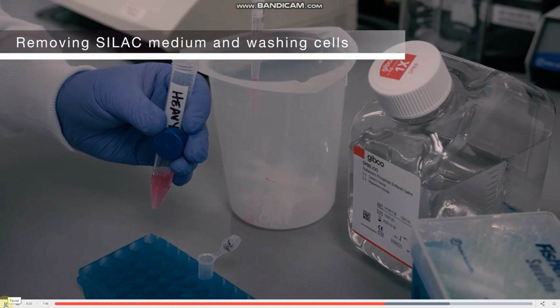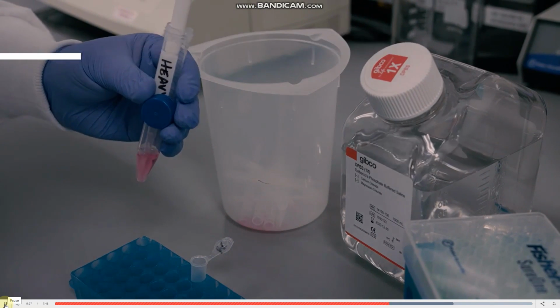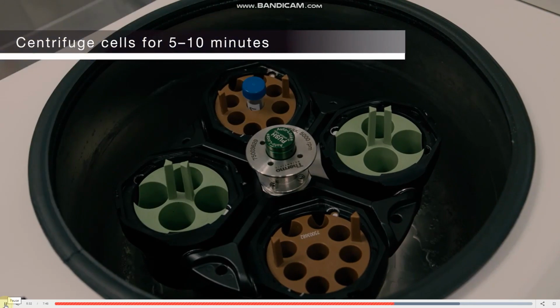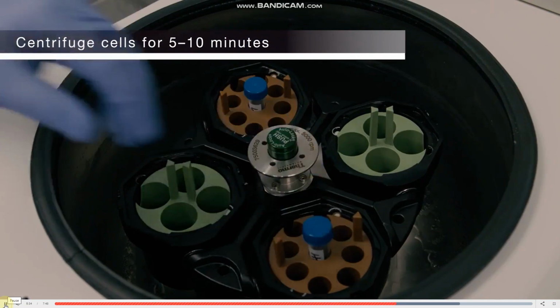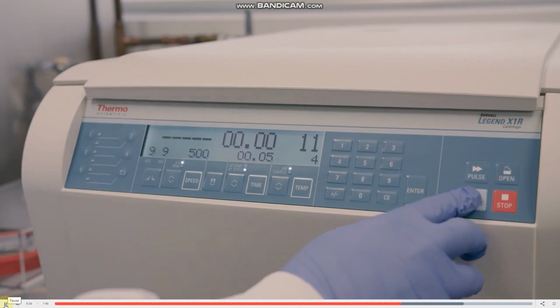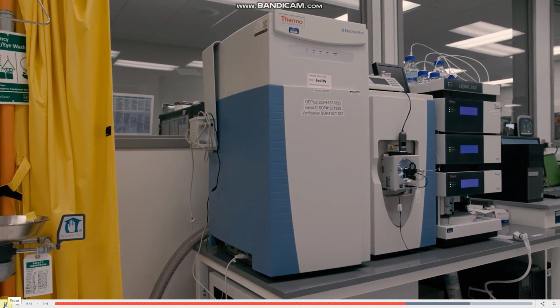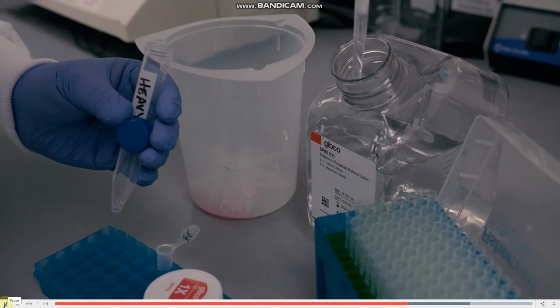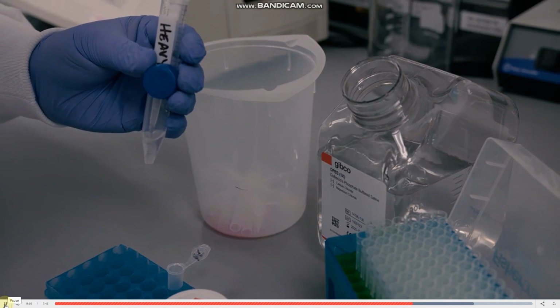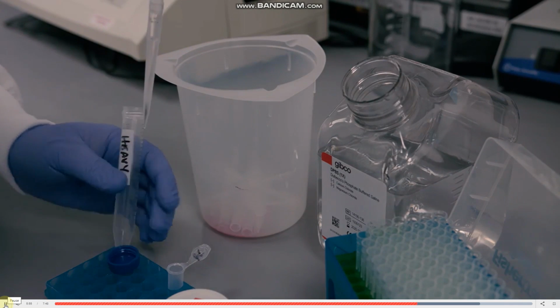Prior to mass spec analysis, the cells should be washed twice using 5 cell pellet volumes of PBS and centrifuged for 5 to 10 minutes at 500 times G to pellet the cells and remove the SILAC medium. The efficiency of isotope incorporation is determined by liquid chromatography mass spectrometry analysis of the samples labeled with heavy SILAC, or NeuCode, amino acids. Standard in-solution or in-gel sample preparation techniques can be used to extract, reduce, and alkylate cellular proteins before enzymatic digestion with Lys-C protease or trypsin protease to generate peptides.